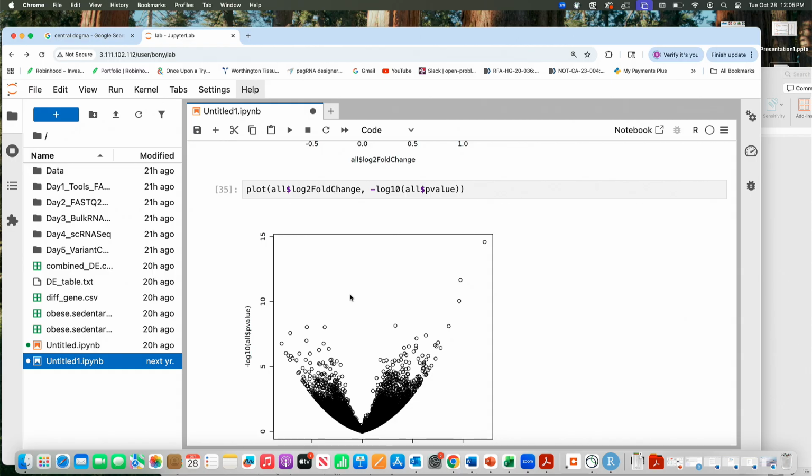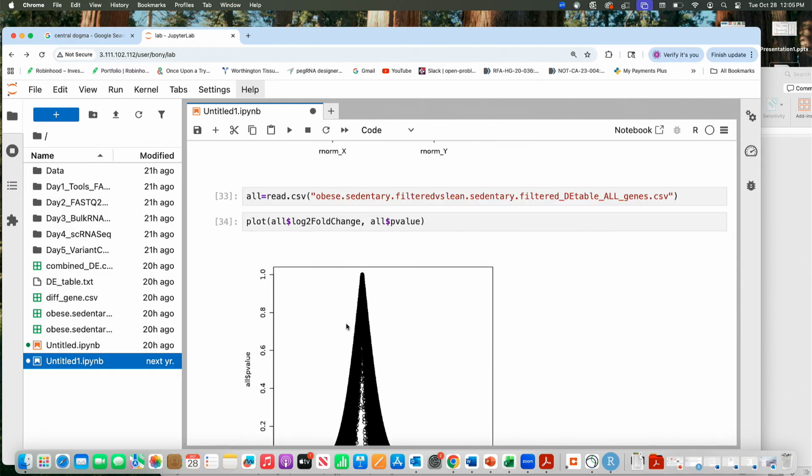Basically, we are getting an error. Show the previous command where you removed minus log 10. I think you might be struggling with parentheses. So just use the plot, the way you plot the scatter plot. Forget about what else you are doing. You want to plot two columns, the p value column and the fold change. That's the first thing I want you to do.